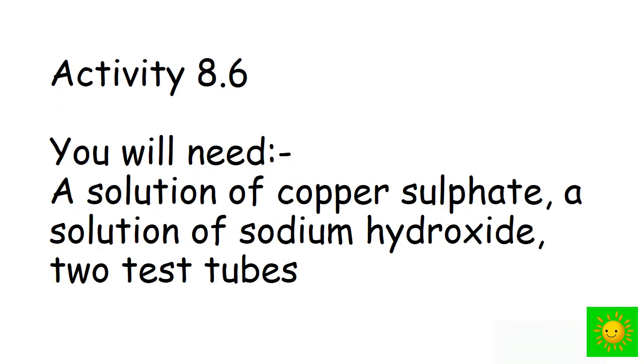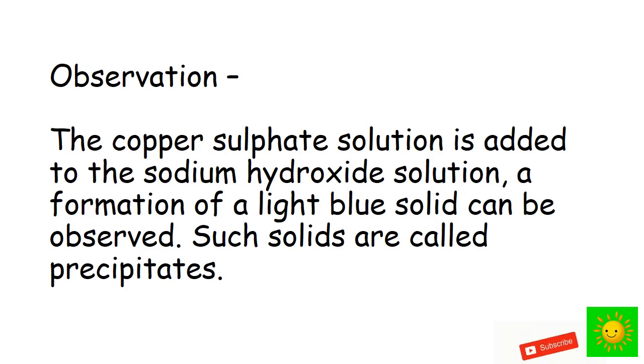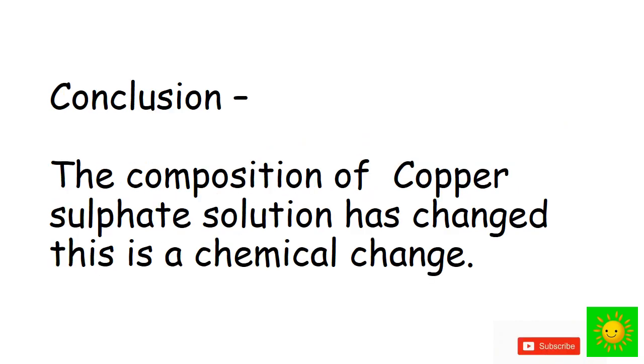Next practical. A solution of copper sulfate, a solution of sodium hydroxide, and two test tubes. Mix copper sulfate solution with sodium hydroxide. When the copper sulfate solution is added to the sodium hydroxide solution, a formation of light blue solid can be observed. Such solids are called precipitates. The composition of copper sulfate solution has changed. This is a chemical change.